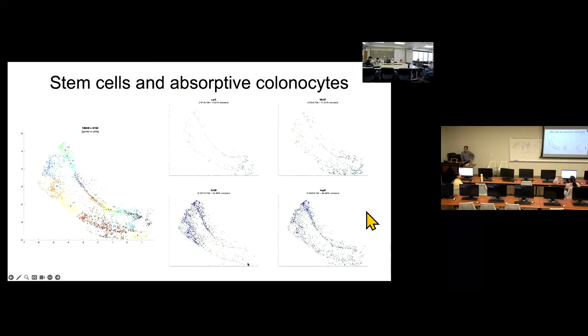So this is what I have to do. I just have to look at the expression across these figures here and then try to label these clusters here as a specific cell type. Again, this isn't finished just yet. I need to input a lot more details into this so that somebody can actually follow it. But for the most part, this is how we identify cell types in the colon.